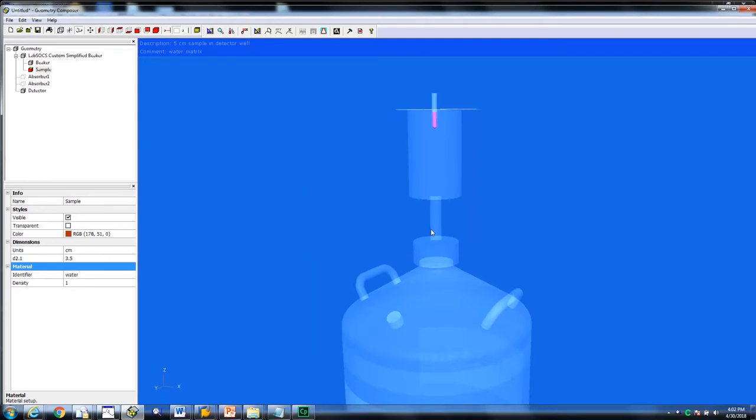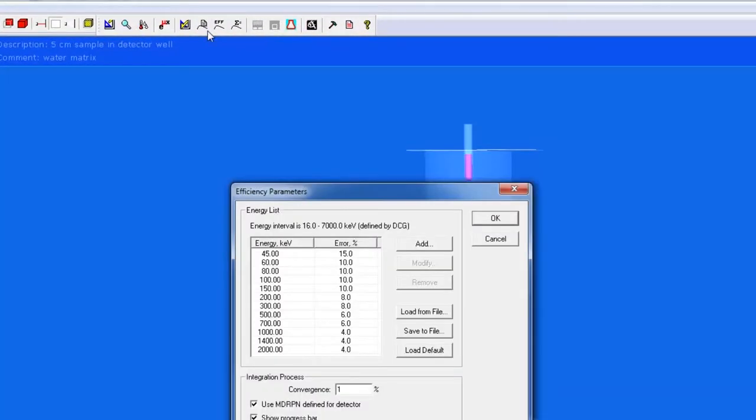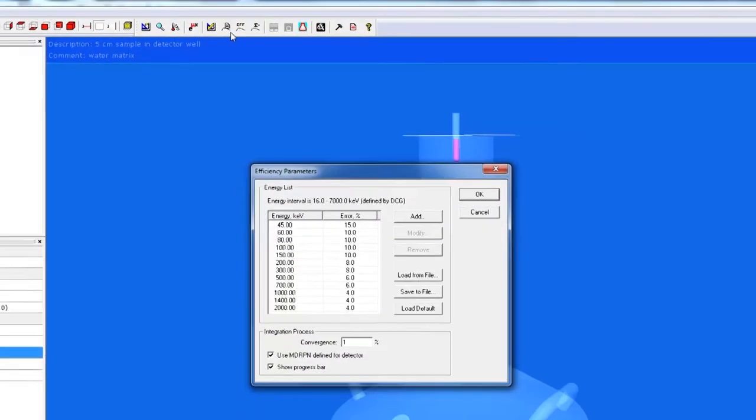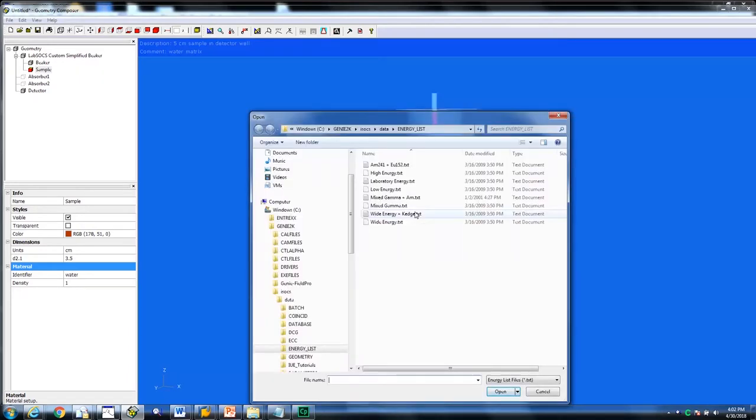To define a range of different energies, click on edit efficiency curve parameters. Some default values are loaded, but you can also go ahead and select a different list by clicking on load from file. Select the file of interest and click open.